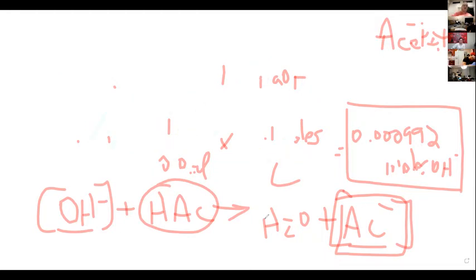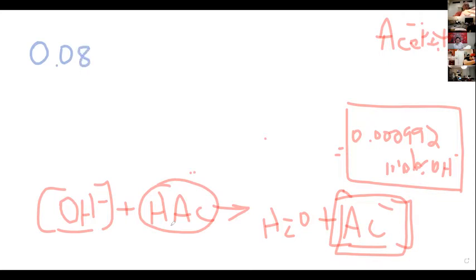We calculated that. To do that, we use the concentration. I think the concentration was around 0.0885 or something like that.